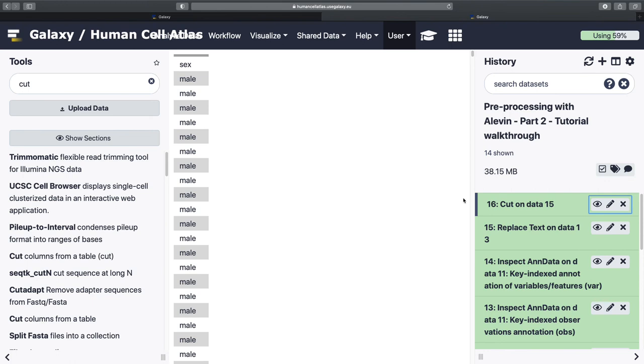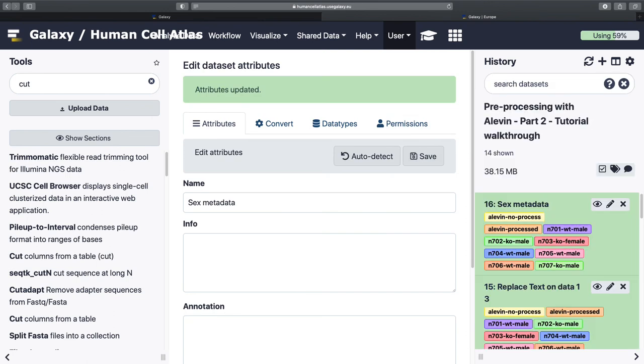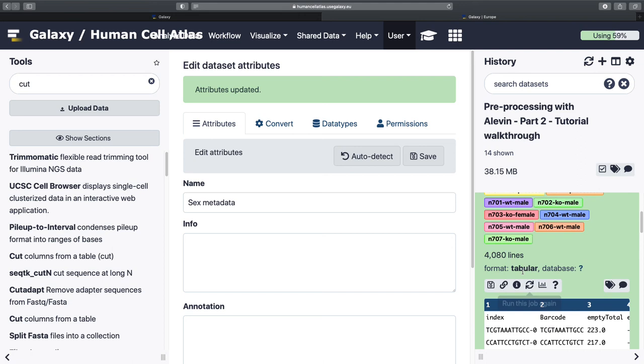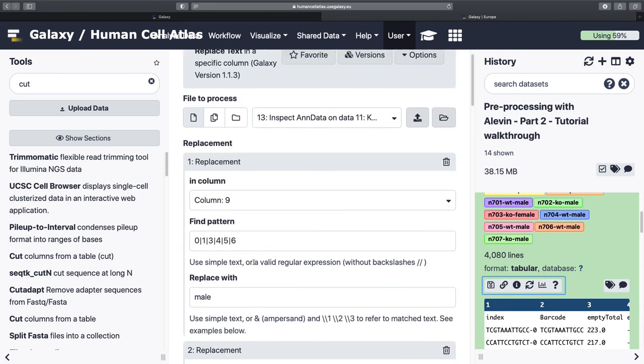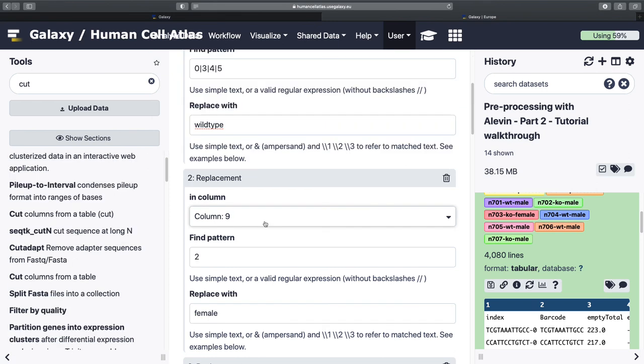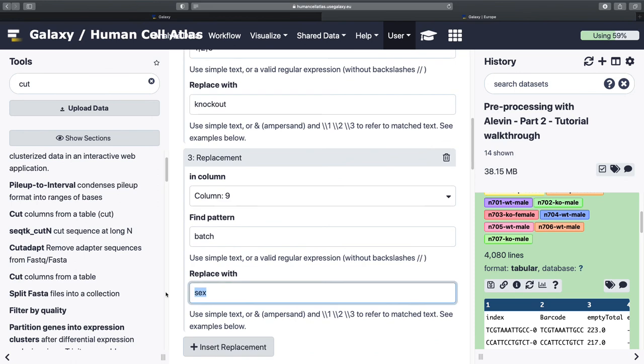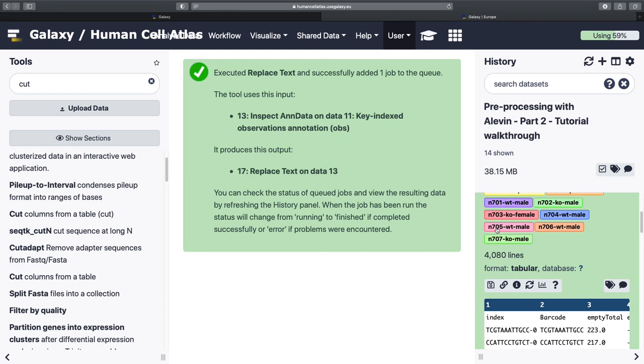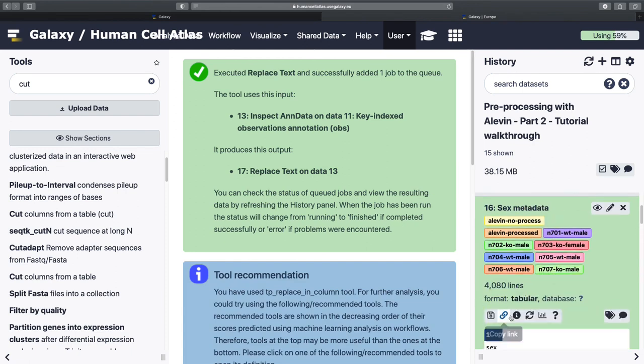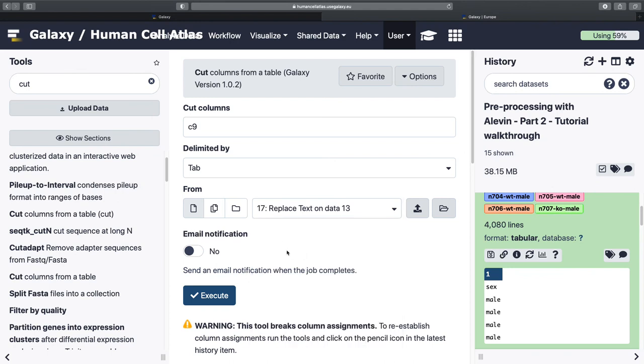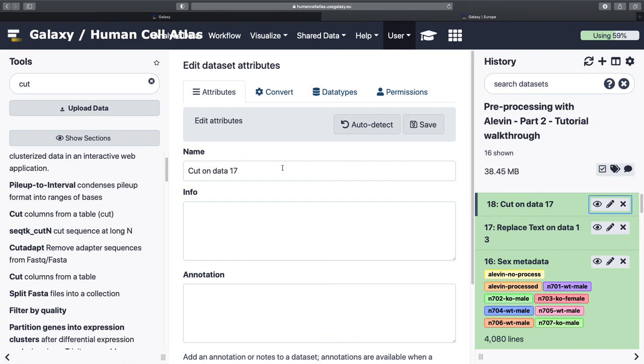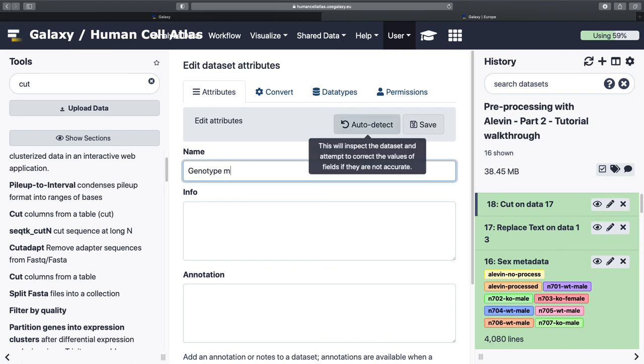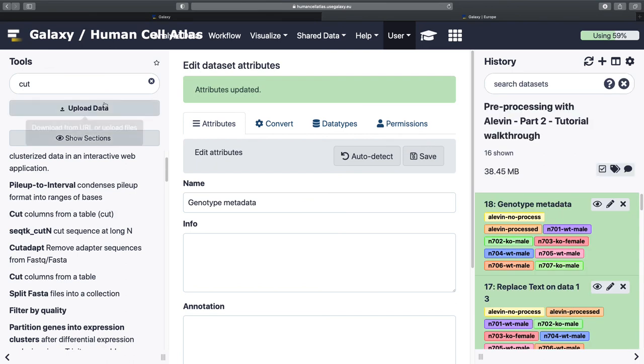All right, and then this should give us, yes, our column of sex metadata. And now we're going to do everything again, but we're going to label them by genotype instead. So let's do this again. We're going to switch it, and it's going to be 0, 3, 4, 5, and you're going to be wild type. 1, 2, 6. And then we're going to be calling this genotype. And then now we can call that our genotype metadata.